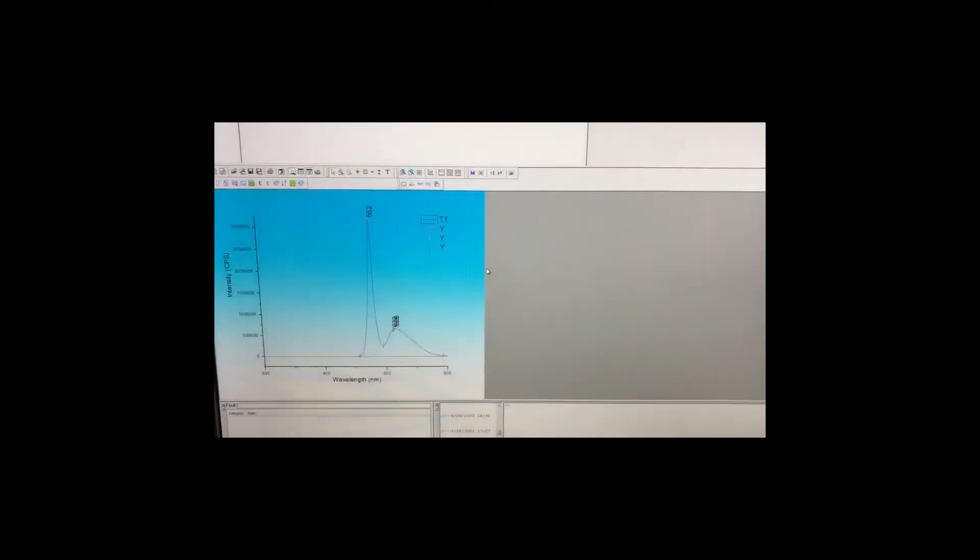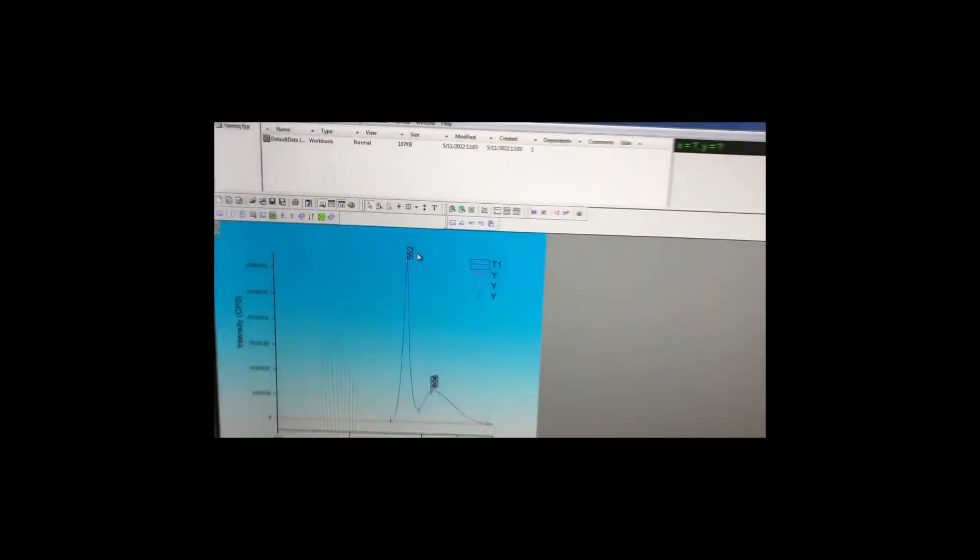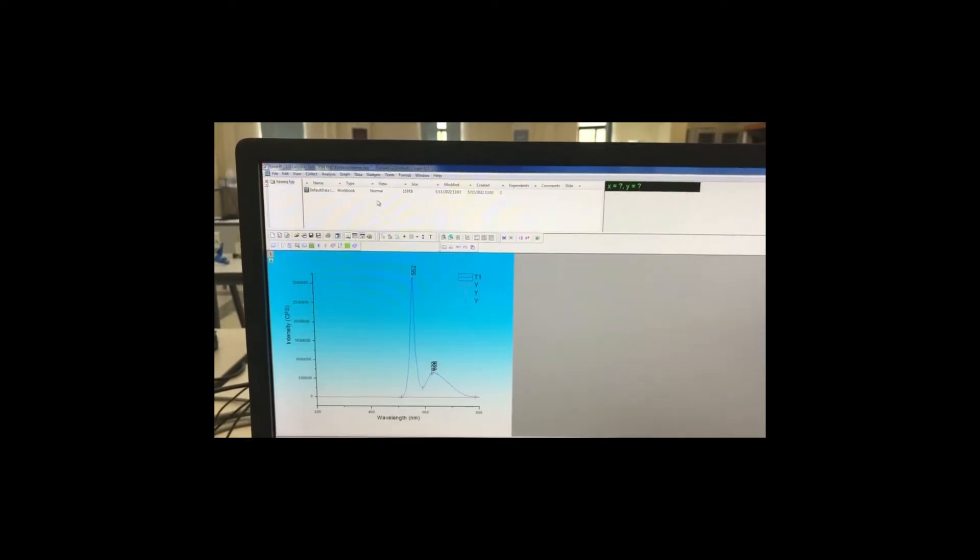This is to show us what the peaks look like. So after we get this number, now we can do the real time control.